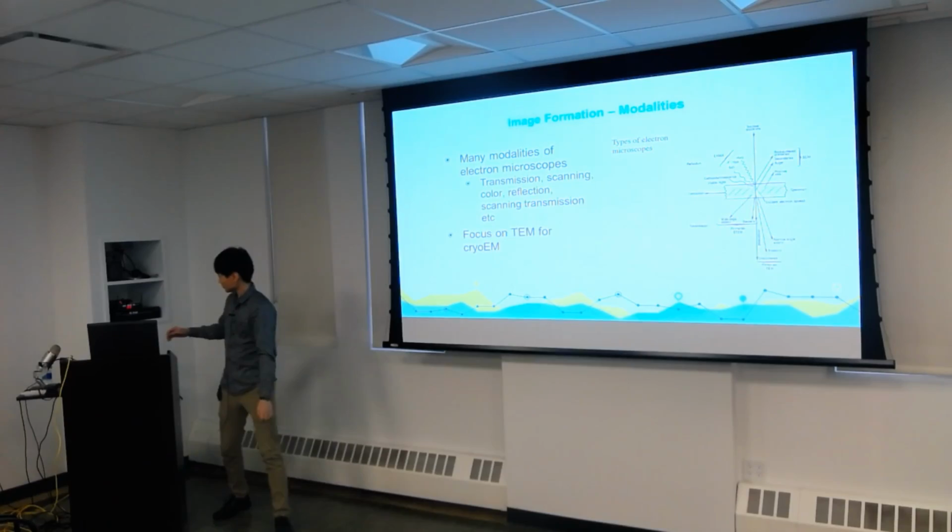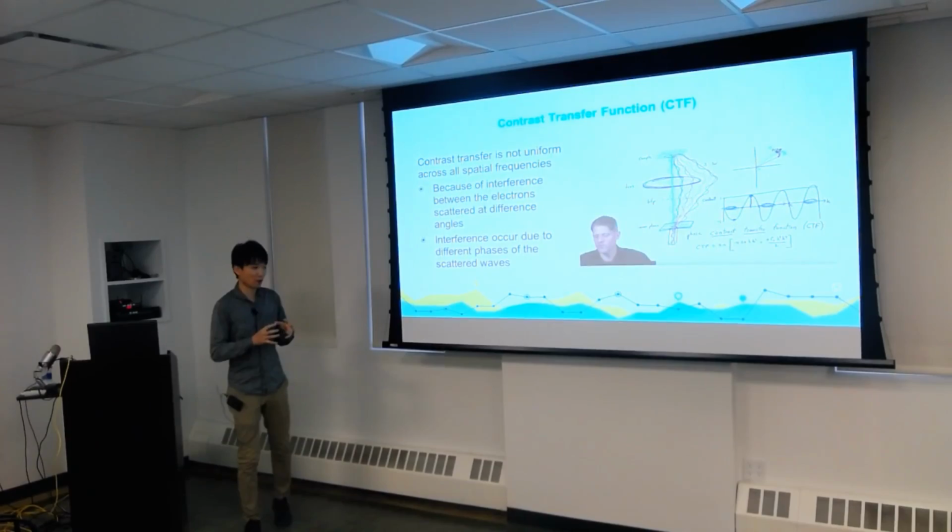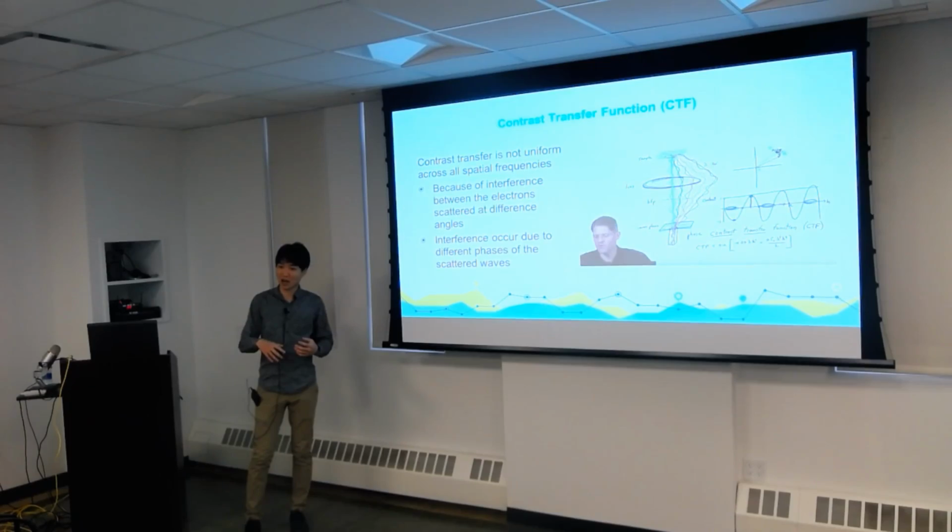Okay. Yeah, so this will be the main focus, because a lot of the things I'll be focusing on will tie back into how the contrast transfer function changes with all these effects. So having an idea of how the contrast transfer function works allows you to understand the basis of image formation.